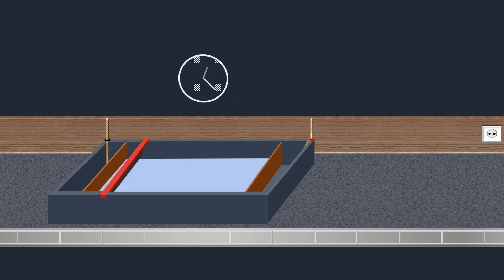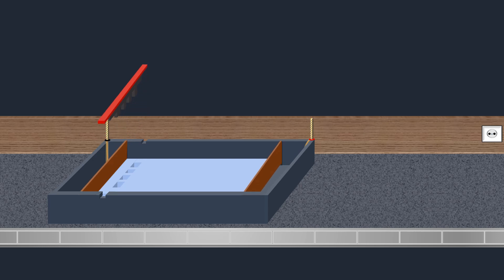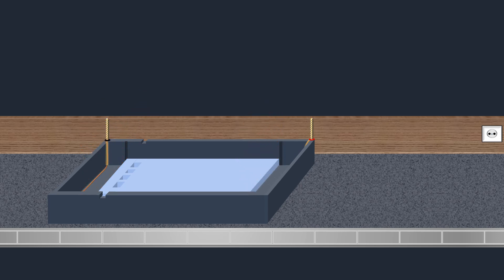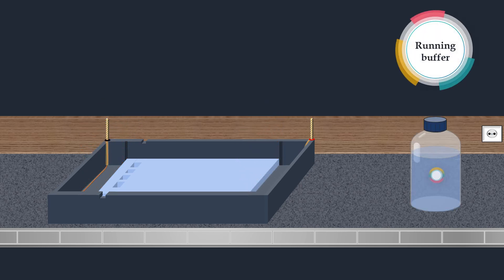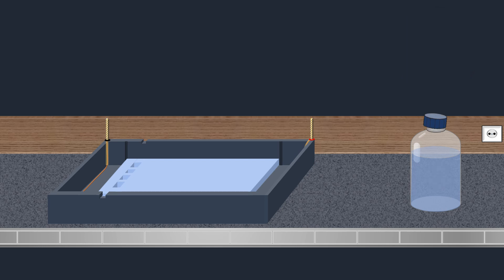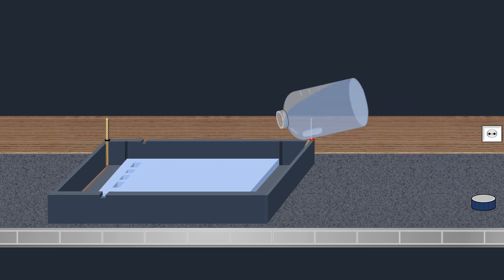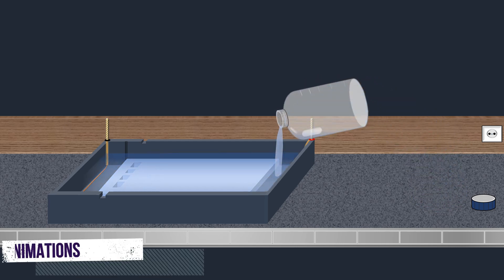Once the gel has solidified, the comb is carefully removed as well as the casting dams. Next, the gel is submerged in a TAE or TBE running buffer which is used to provide ions that carry a current and to maintain the pH at a relatively constant value.